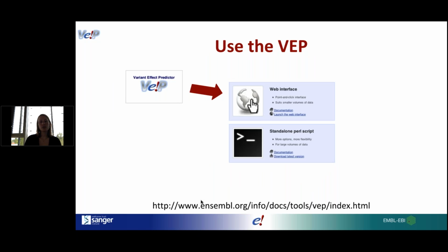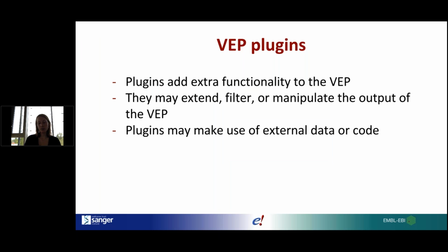So today I'll be showing you how to use the web interface of the VEP, but we also have a standalone Perl script, again, that you can run from the command line. And this is appropriate if you're more of a power user. And the VEP has various plugins that are available for use with it. The plugins can add extra functionality, so they can draw on external data or external code, and they can extend, filter, or manipulate VEP output.